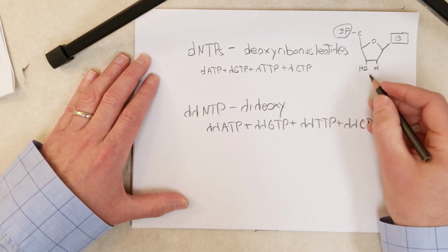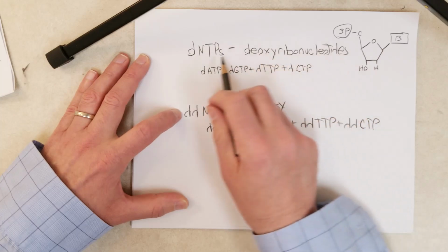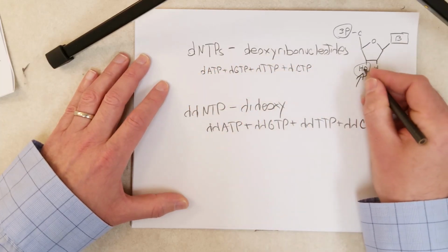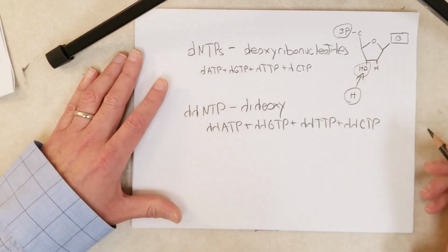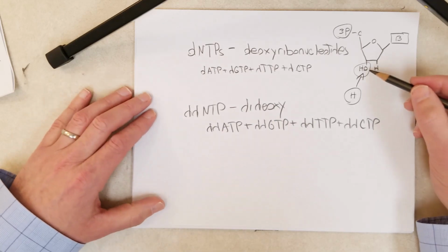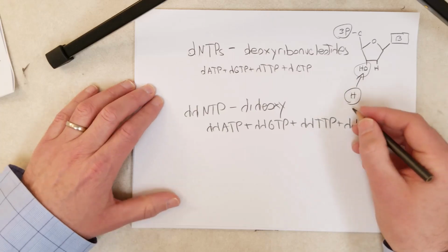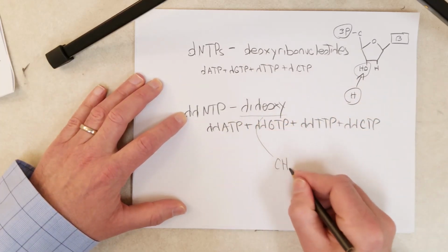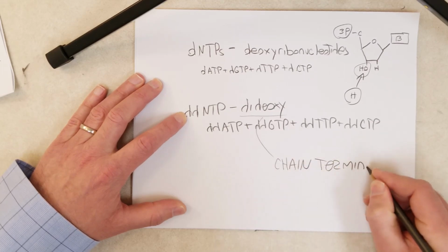And so dideoxy, well, essentially what that means is it's identical to a deoxyribonucleotide, but instead of that OH there's no OH there. It's usually an H. So no OH there. And what does that mean if there's no OH? It means a dideoxyribonucleotide is a chain terminator.